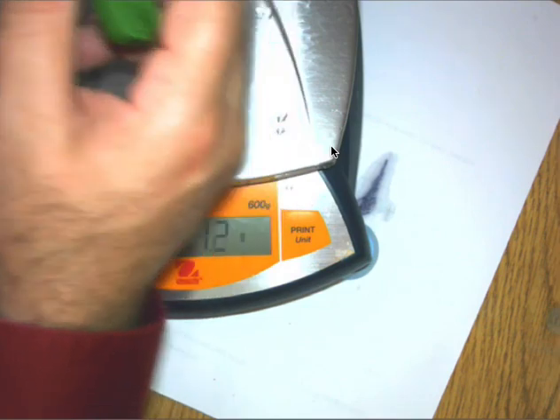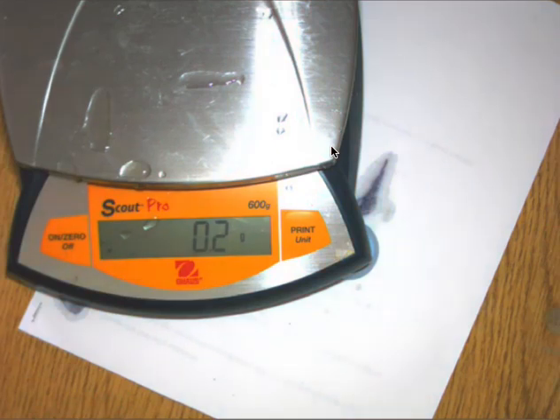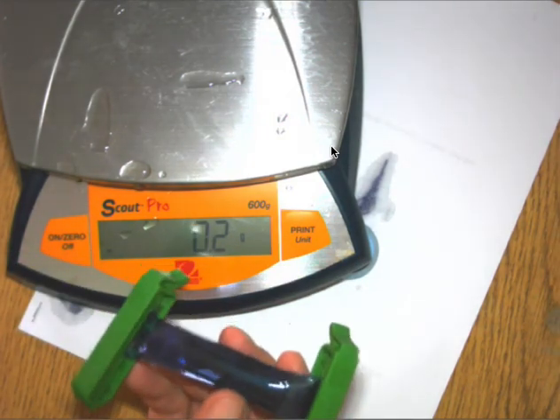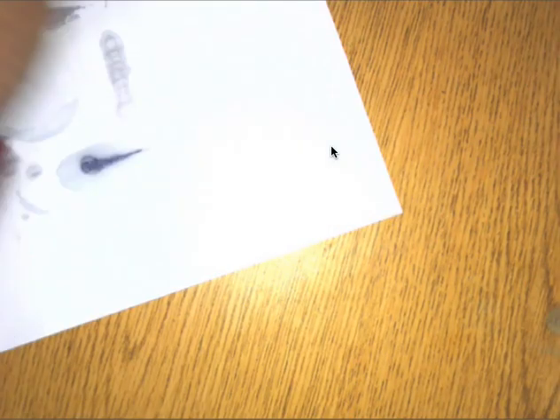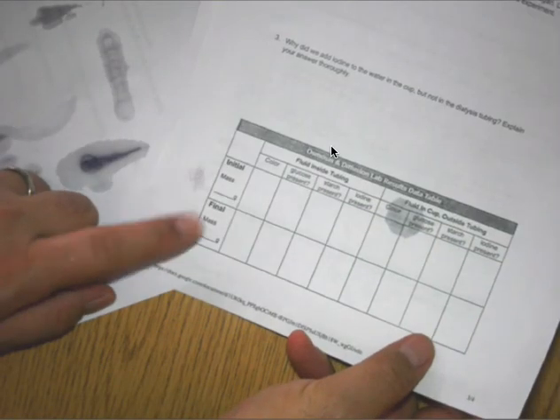Is the iodine that we added, that entered into this dialysis tubing, enough to make up for that much of a difference in mass? No, of course not. So what could have then moved into the dialysis tubing to increase its mass? All right, so make sure that you write the mass in the appropriate spot.